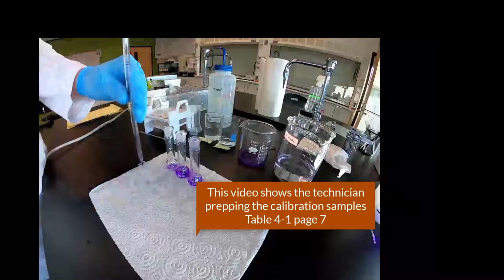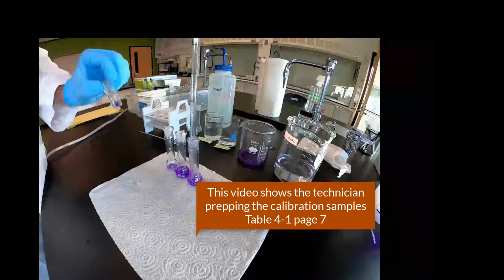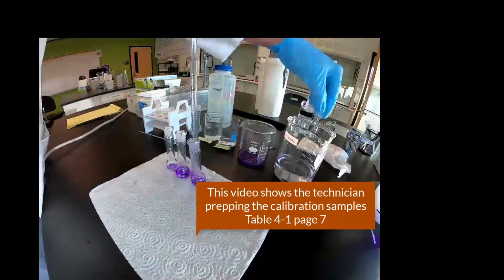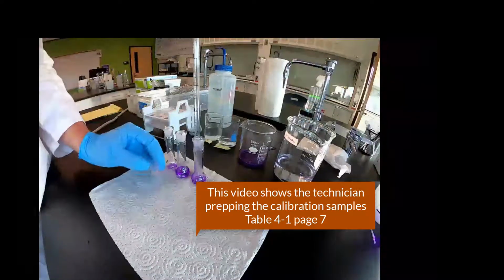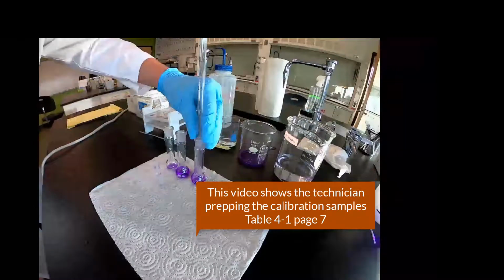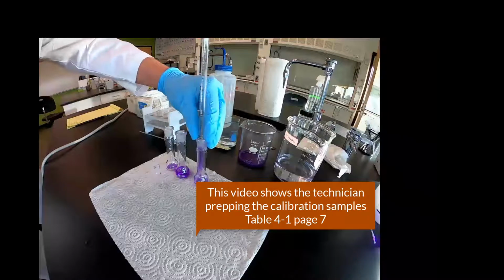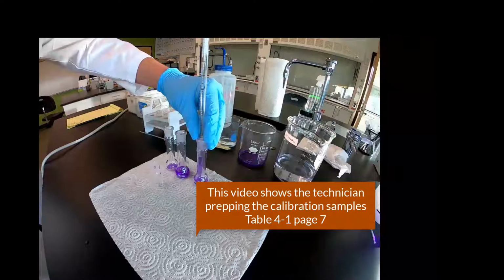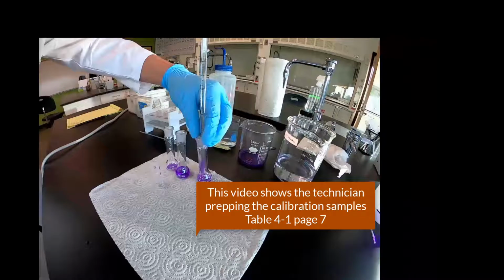Okay, now he's going to just go ahead and make the cuvette with the concentrated in it. And again, this is great. Going to do a little rinse with what's about to go in there. Good. So there's going to be a cuvette that holds the concentrated. You don't have to draw it with the volumetric. You could just use those little throwaway dispensers, but this is fine. It's already been used to draw mother solution anyway, so that would be appropriate.